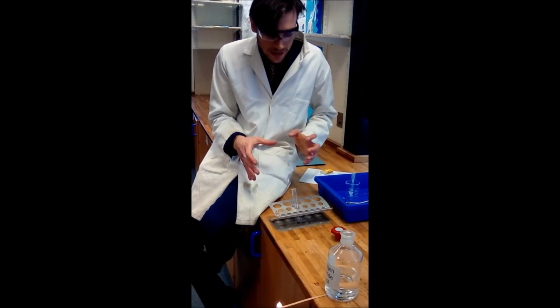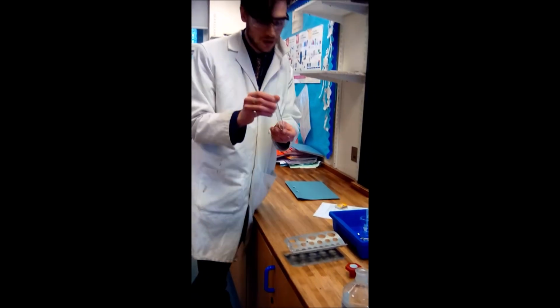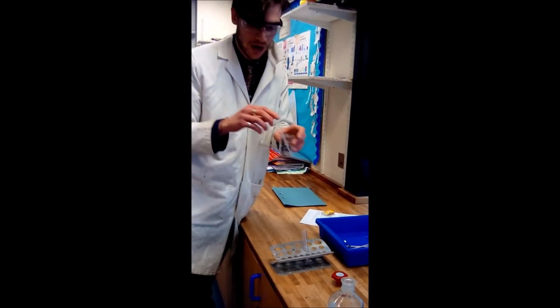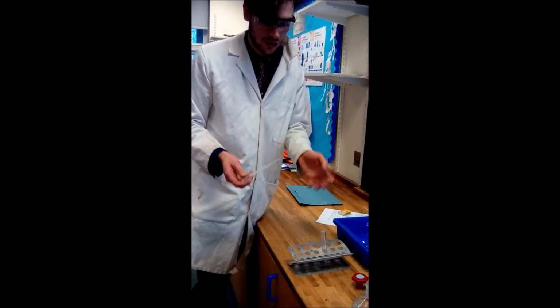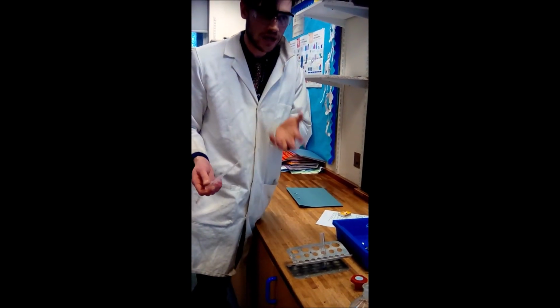We're going to do another test now. I'm going to test for oxygen. So what I've got in here is a little bit of manganese dioxide, and in here I've got some hydrogen peroxide. What happens when you add hydrogen peroxide to manganese dioxide is it releases oxygen. We're then going to test for the oxygen, because what it should do is relight my splint.